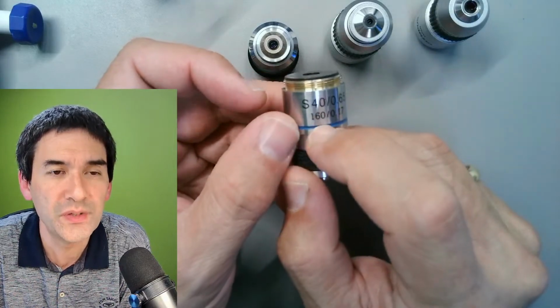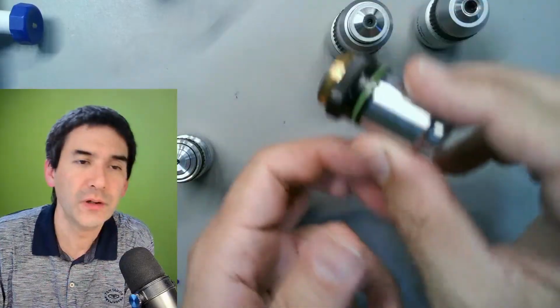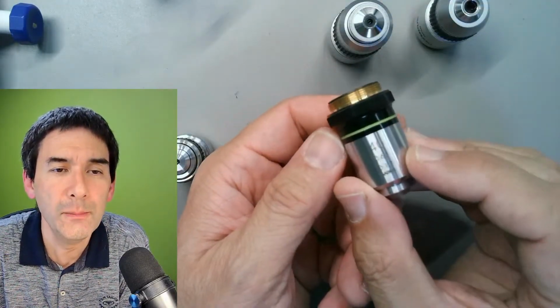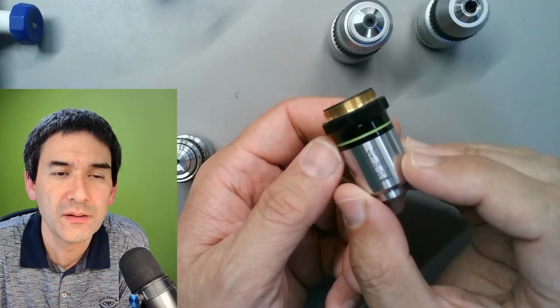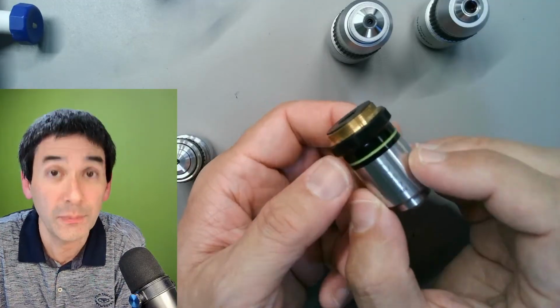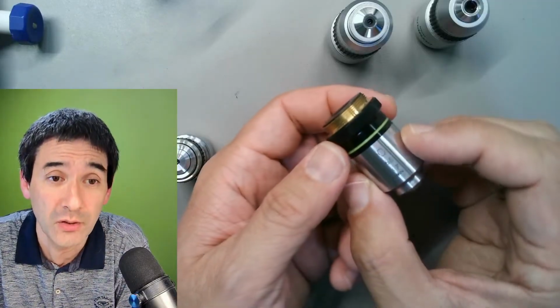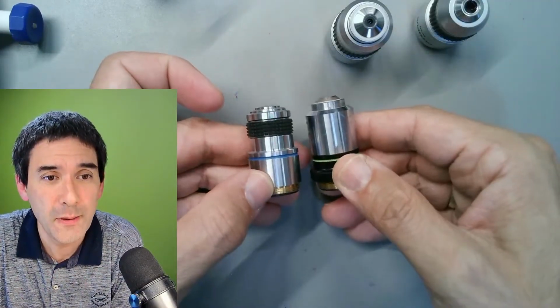It has 160 written on here. This one over here is an old Olympus objective from the 1970s. So also 40 times. It does not have the 160 written on here, but it is a 160 millimeter tube length objective. Look, almost the same size.